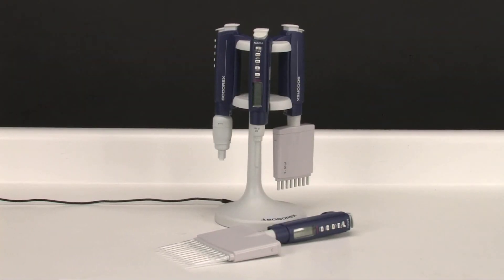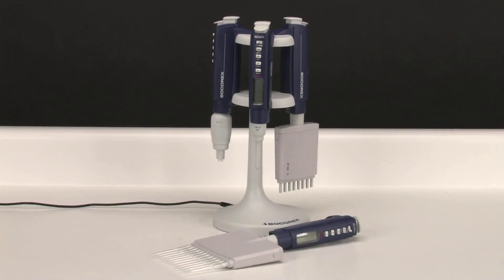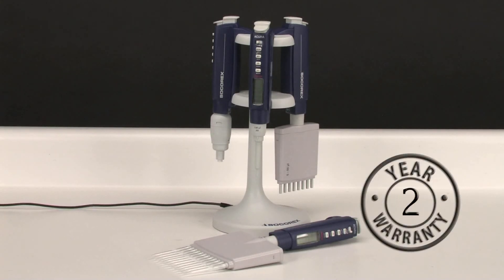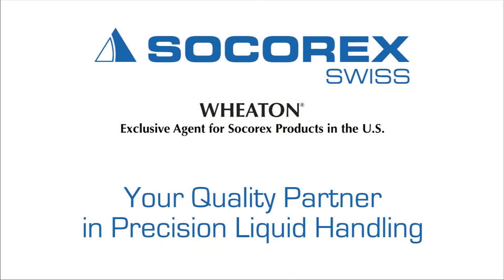Socorex pipets are engineered and crafted from the highest quality materials to ensure reliable, long-term, high-precision operation. They come with an individual QC certificate and an industry-exclusive two-year warranty. Socorex is your quality partner in precision liquid handling.